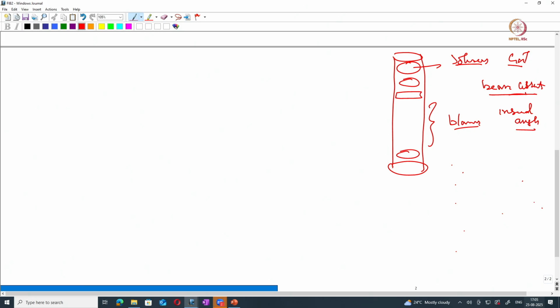Whenever you don't want sputtering to happen, you can put the blanking plates, which block the ion beam from interacting with the sample surface. So this is typically the interaction we discussed, the ion beam interacting with your sample surface, and we basically only talked about the sputtering process.